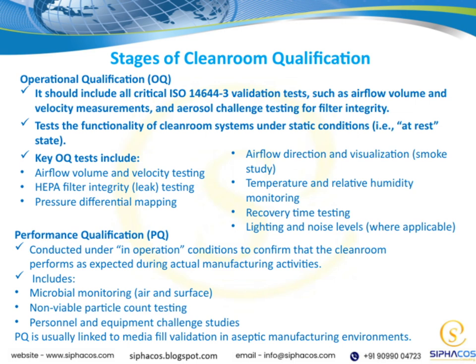Key aspects of PQ include microbial monitoring of both air and surfaces to ensure contamination control, as well as non-viable particle count testing to measure airborne particles that aren't alive, but could impact product quality. We also perform personnel and equipment challenge studies to verify that our processes are robust. Additionally, PQ is often linked to media fill validation in aseptic environments, which is crucial for ensuring sterility.